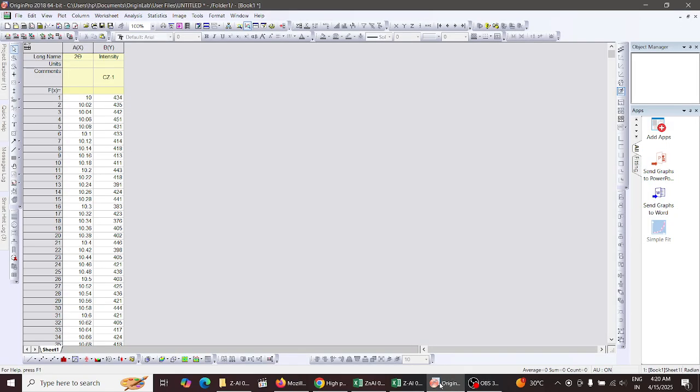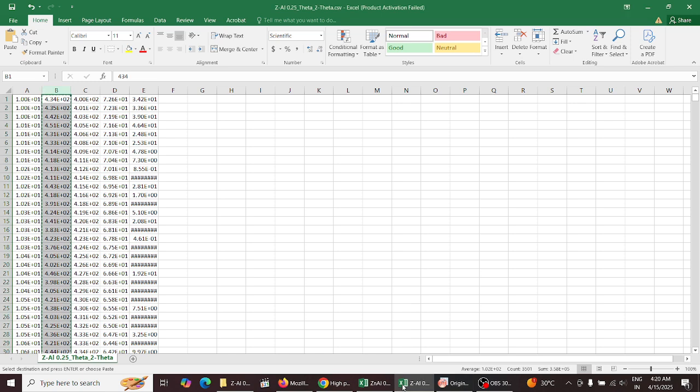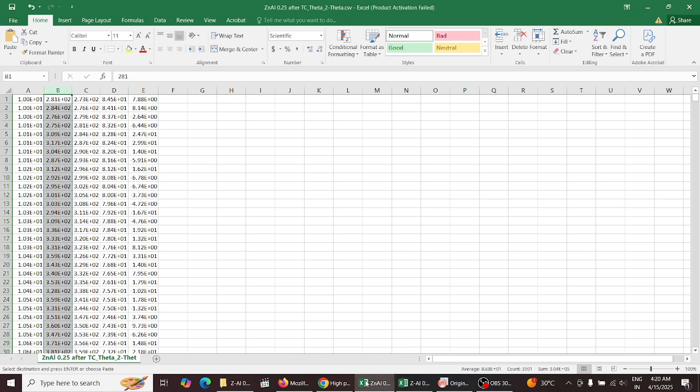Hello friends, in today's video we will talk about the smoothing of the data in the XRD plotting. So first of all, what we have to do is open my raw file. Okay, so already I've opened my raw file.